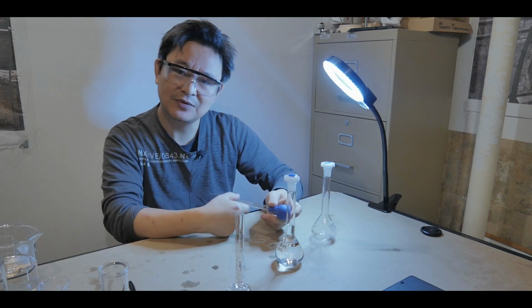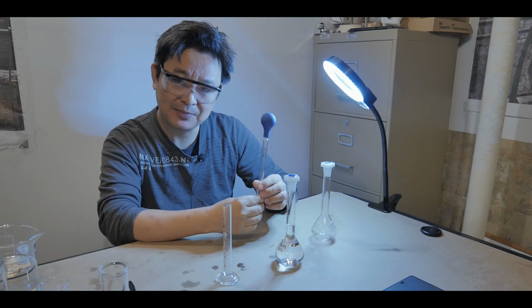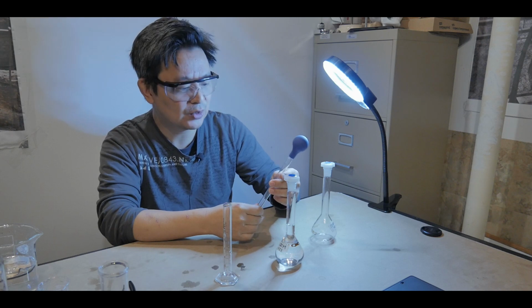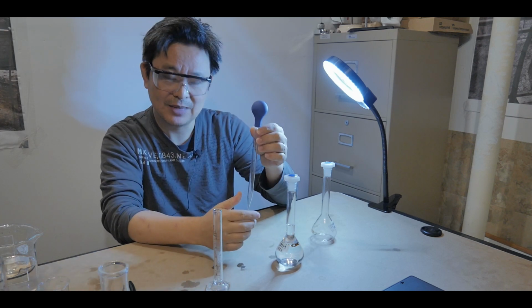Okay, so I would advise you, if you want to do a more accurate serial dilution, instead of using the graduated cylinder, use a pipette, 10 mils pipette. This is a little bit more accurate. It's most likely plus or minus 0.1 mil instead of 0.2 mils. Okay, and one I would recommend.